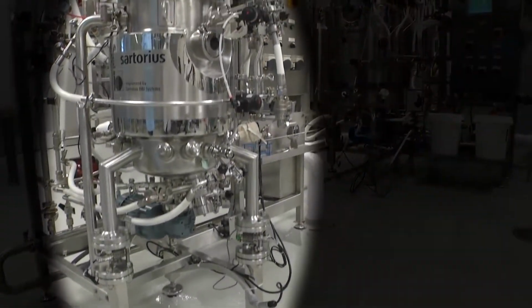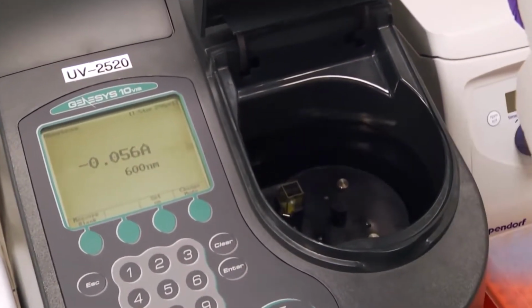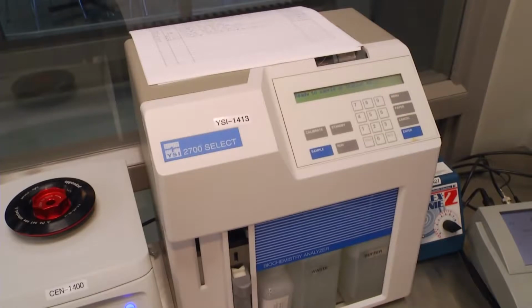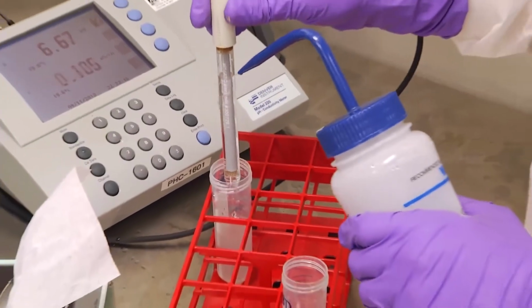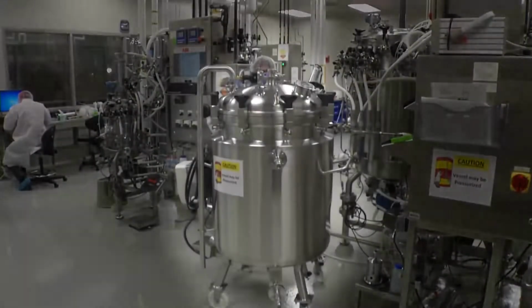The equipment that we'll be using includes a 300-liter bioreactor, a UV-Vis spectrophotometer to monitor the optical density, which is a measure of the concentration of cells in the bioreactor, a glucose analyzer to measure glucose, a key nutrient, an offline pH meter to help track the acid-base balance and adjust online measurements if needed, and a broth tank for our final product.